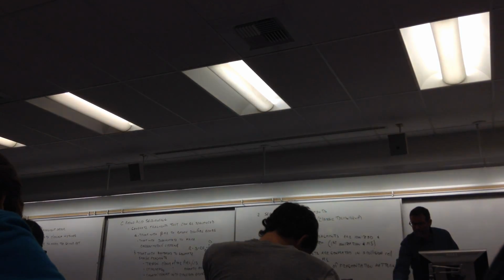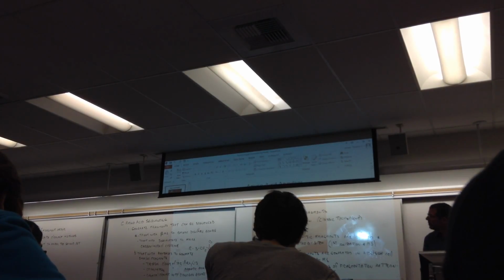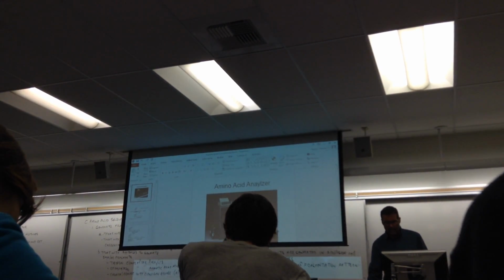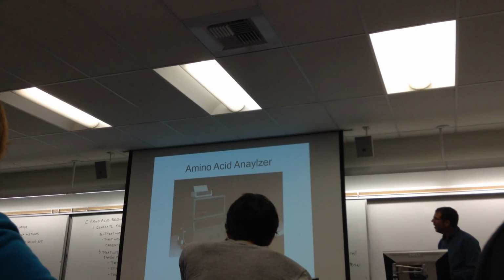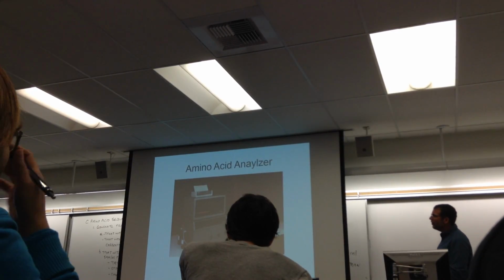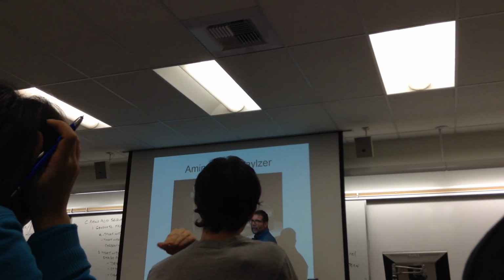All right, so here's just a picture. First of all, the total amino acid analysis, this is what one of those machines looks like.